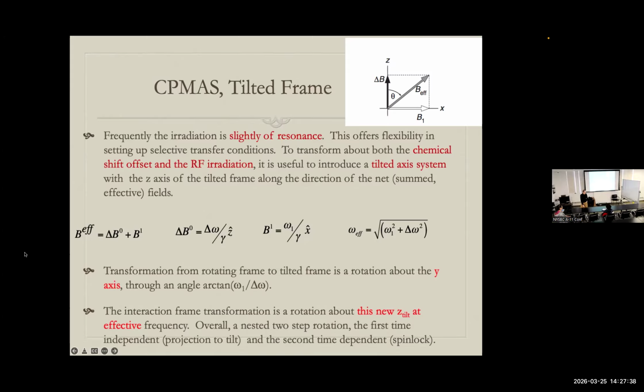Are we matching them like we did in this problem? They had to be matched in order to get rid of that and get the maximal effective dipole coupling. With magic angle spinning, maybe that's the right matching condition and maybe not. So we're going to find out. Okay, so the CPMAS, we haven't done the MAS part yet. So that's where we start tonight. Any comments, any questions?